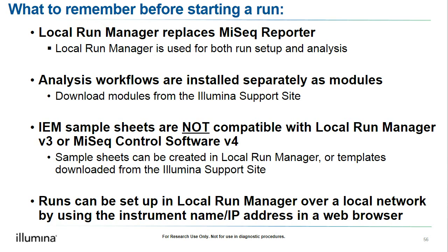IEM sample sheets are not compatible with this version of the software. You can download sample sheets from our support site, create runs in Local Run Manager, or download templates from Local Run Manager itself. You can also set up runs remotely. So this is useful if you want to use Local Run Manager mode but are not in front of the machine. As long as you're on the same network and the instrument allows for network access, you can just use the instrument name or IP address, set up your run, and then that will be ready to select once you're in front of the instrument.